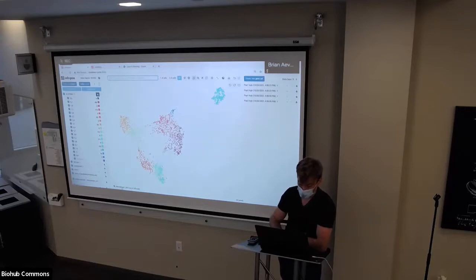And so in order to avoid clutter in the resulting file, it'll actually delete all parent embeddings and only keep children embeddings automatically. So we'll just say this is macrophage 1. And you can put H5AD if you want, but it auto appends it if it's not present. H5AD is the file name.